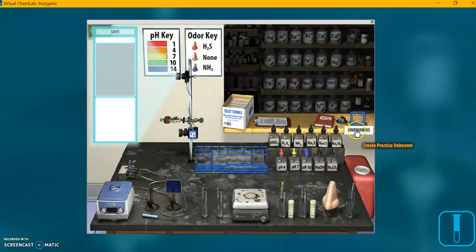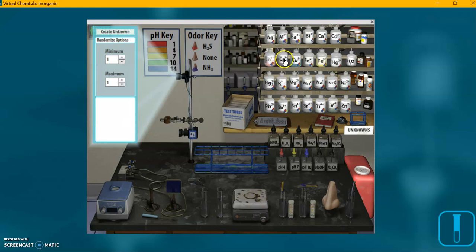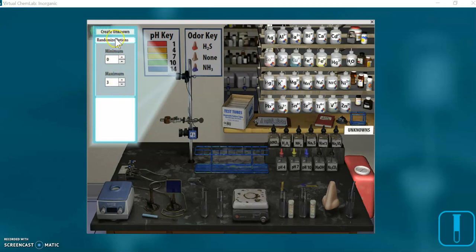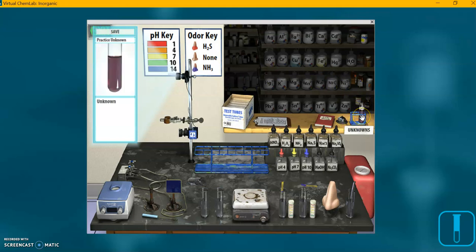I'm coming over here where it says unknowns and clicking the unknown label. Now we're creating a practice unknown with the same ions, so I'm again clicking on cobalt, chromium, and copper. Over here, this controls the practice unknown. I'm setting the minimum to zero, meaning our practice unknown could have none of those ions in it, and the maximum to three, so it could have all three ions, two of them, just one, or none at all — just water. I'm clicking Create Unknown, and immediately it creates a practice unknown for us.